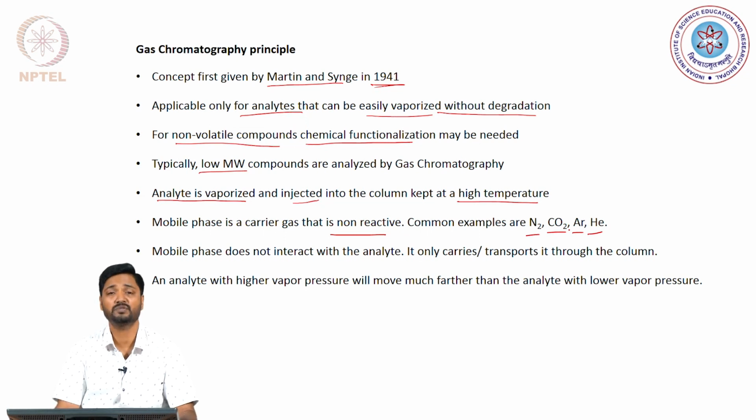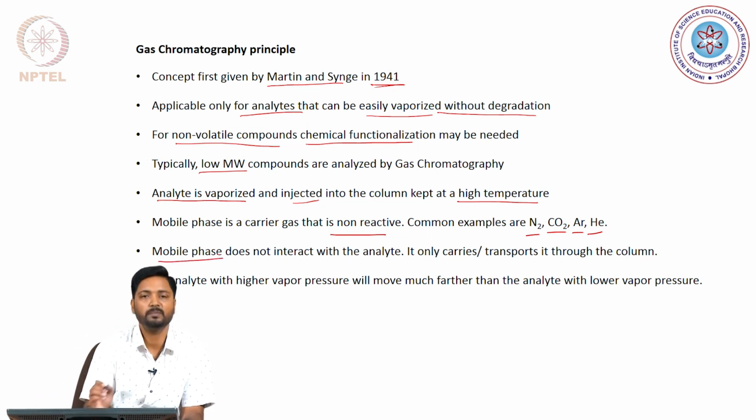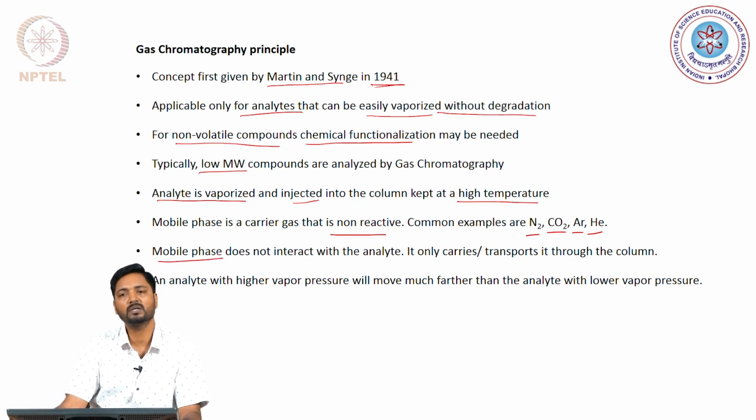Now, it is very important to realize a key difference between the liquid chromatography that we discussed in the previous lecture and gas chromatography. Indeed, gas chromatography is quite different from all the other chromatographic techniques, in that the mobile phase does not react or interact with the analyte.